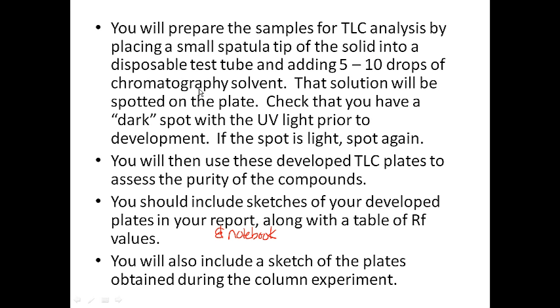So you're going to include sketches of your developed plates in your notebook, and then I'll ask for them in the report, and then you're going to create tables of RF values and identities for both the column experiment results as well as the extraction experiment results. And then also in the report and in your notebooks, you should include a sketch of the TLC plates that you obtained during the column experiment.